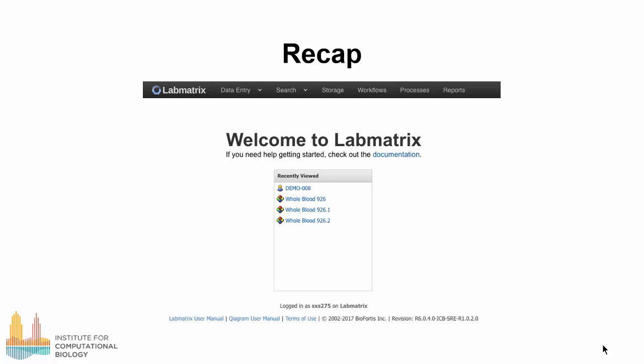This video has provided an introduction to navigating within Labmatrix, how to find your study and to go from study to subject to biomaterials, how to find subject forms, and how to get to the various biomaterial screens. For additional information, you may wish to refer to the Labmatrix User Manual. A link for this may be found in the opening Labmatrix screen.